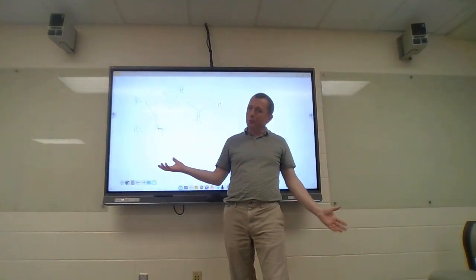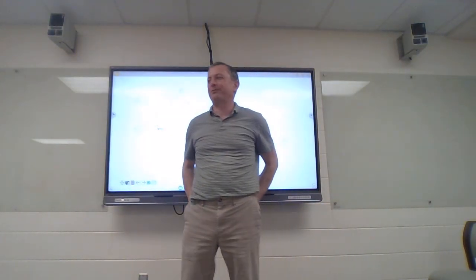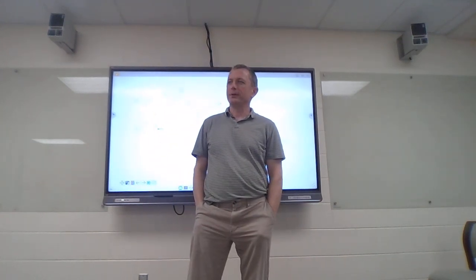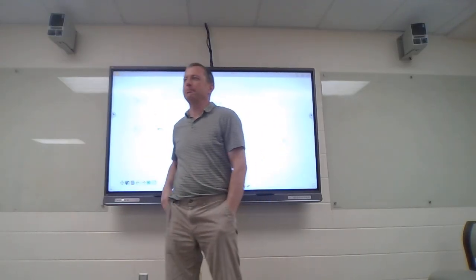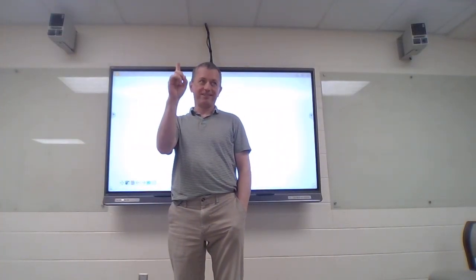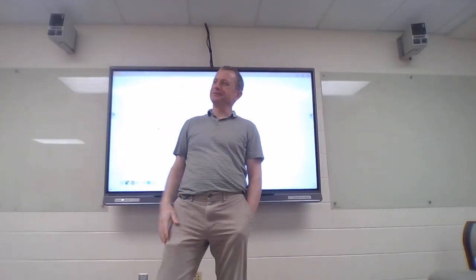Some of them get pretty wild, and you've got to be able to pick out meaningful peaks of them to help support your final conclusions. Okay, but this is a learning process. We're going to keep working on it together. I know that's kind of intense, but just remember, chemical shift first, integration second, maybe splitting, but that gets hard.